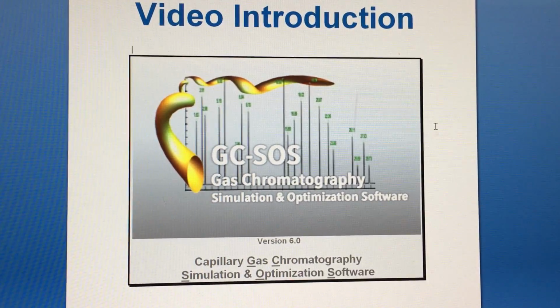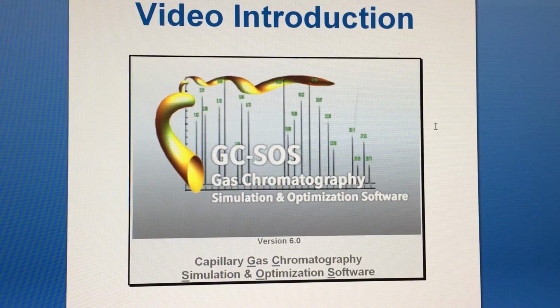I want to give a quick video introduction to GC-SOS gas chromatography simulation and optimization software.